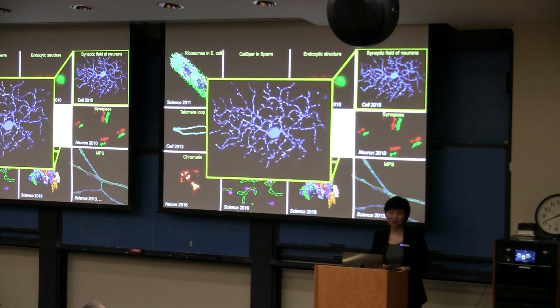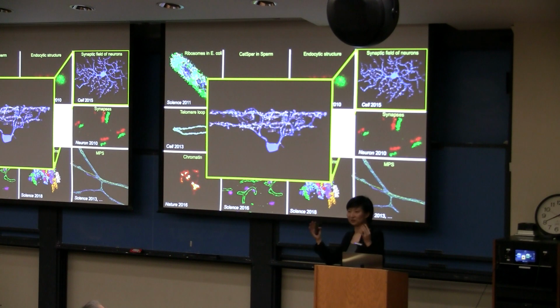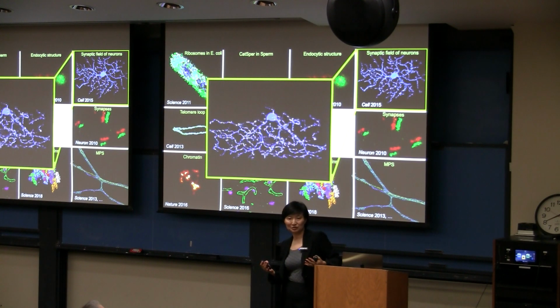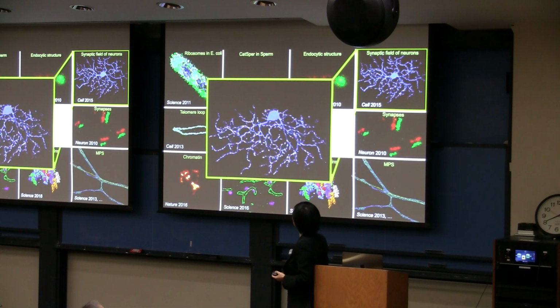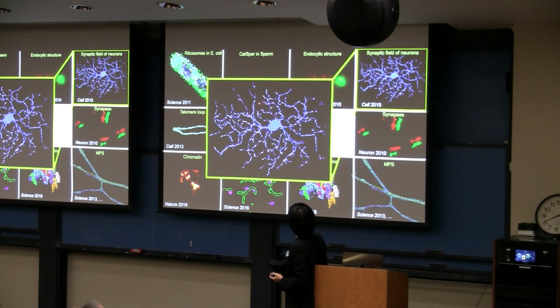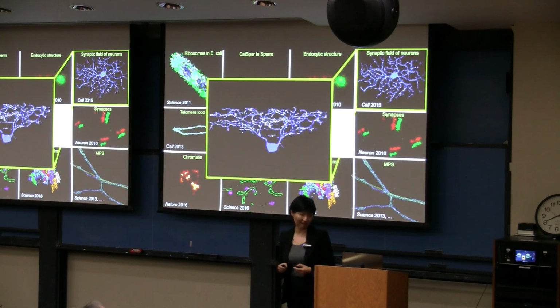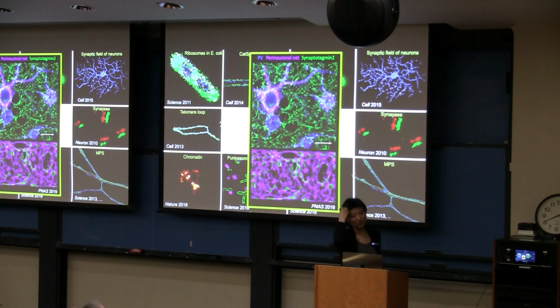And all the way from such small structures to large scale, we can use it to look at neural circuits, to see how neurons are connected, to look at each individual connection, which are these synapses, and to see what kind of connections they are. And then also even look at things in pathological tissue.